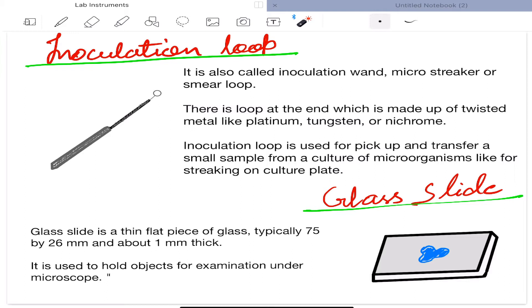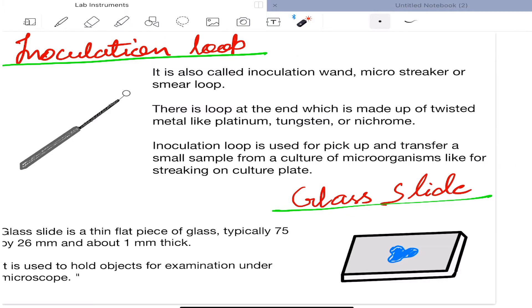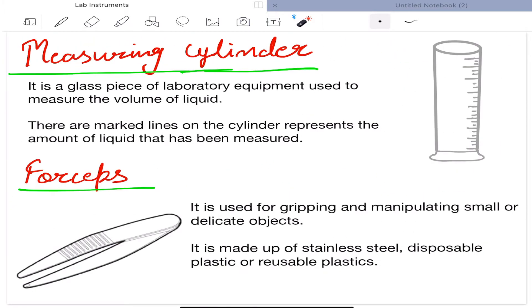Next is glass slide. Glass slide is a thin flat piece of glass, typically 75mm by 26mm and about 1mm thick. It is used to hold objects for examination under microscope. Next is measuring cylinder. It is a glass piece of laboratory equipment used to measure the volume of liquid. There are marked lines on the cylinder representing the amount of liquid that has been measured.